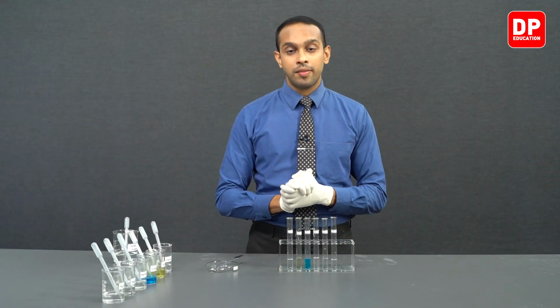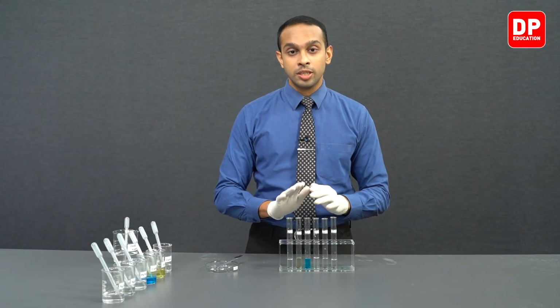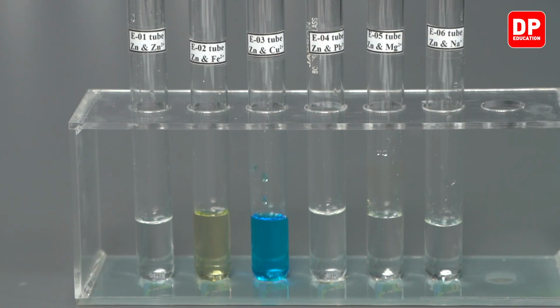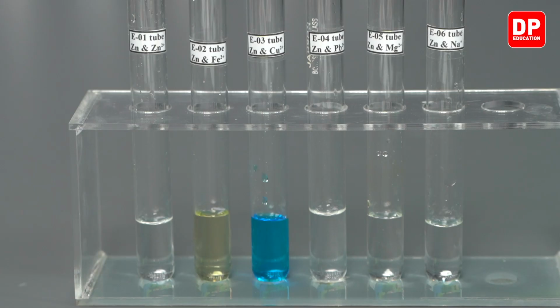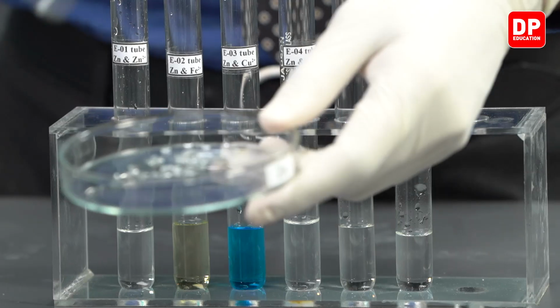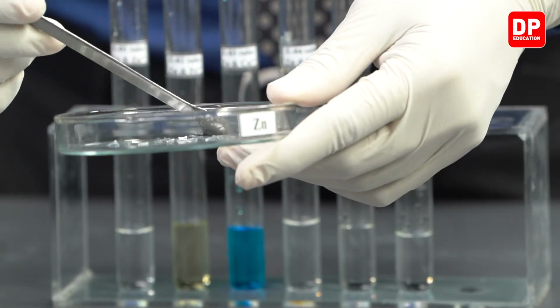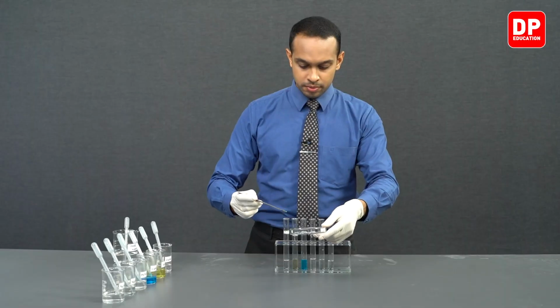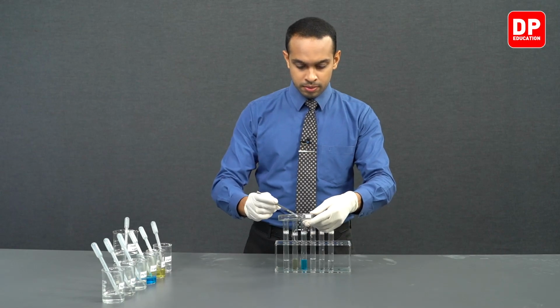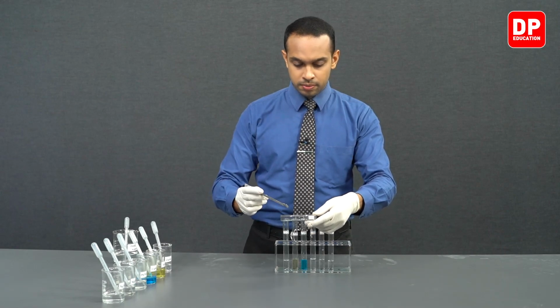Now students, we have added the solutions into each of these test tubes. It is time for us to add the zinc metal to each of these test tubes. We have our zinc metal here. So we will take a small amount of zinc and add to each of these test tubes over here.